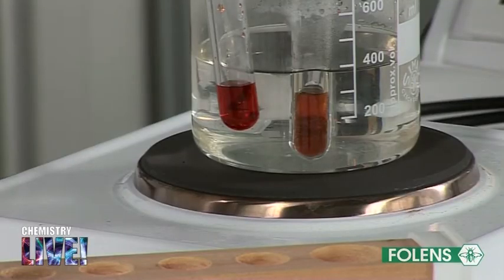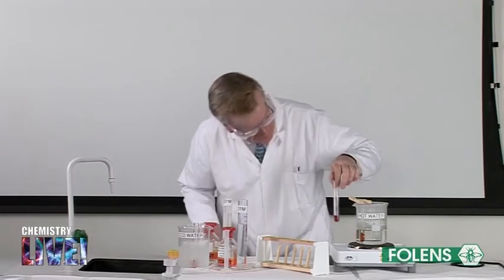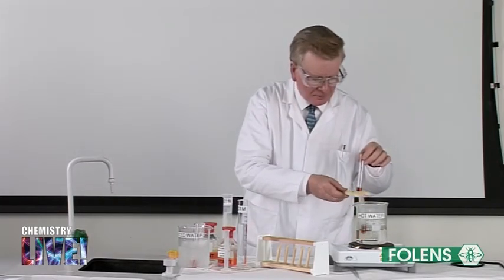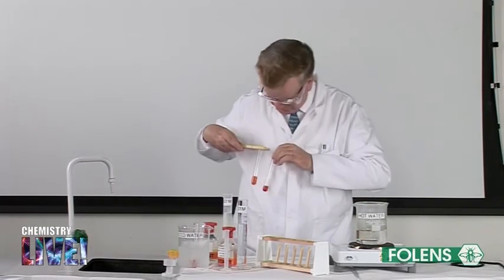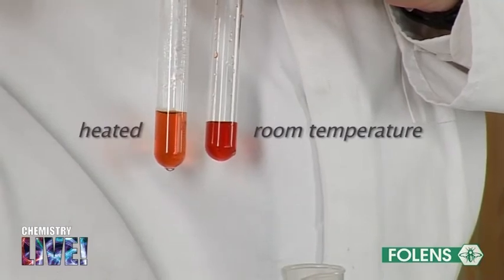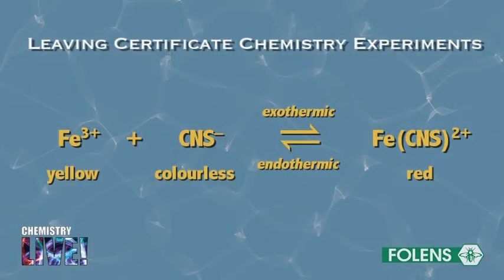Note that the red colour becomes lighter in the test tube placed in hot water. In this case, the equilibrium shifts to the left of the equation shown on the screen — that is the direction of the endothermic reaction — in order to absorb the added heat. Therefore, the red colour becomes lighter and the yellow colour appears. This observation is in keeping with Le Chatelier's principle.